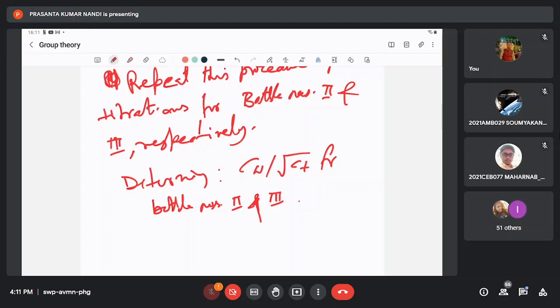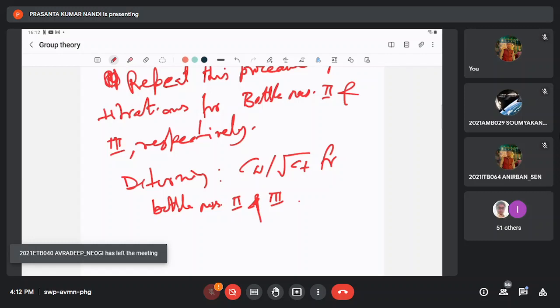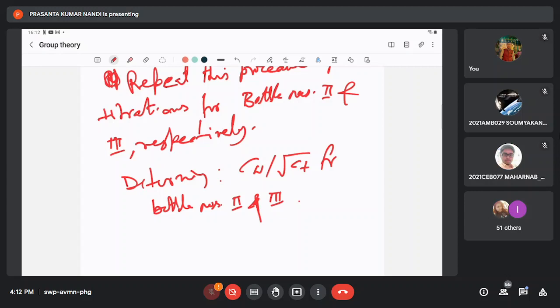Hello? How to standardize using the supplied N by 20 NaOH solution?